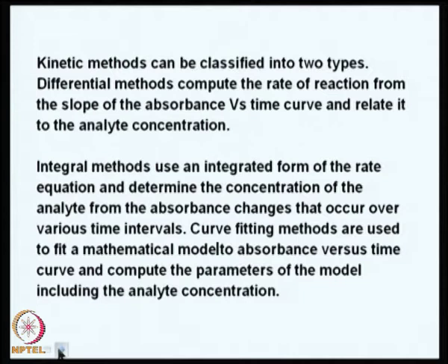For example, in the spectrophotometric follow up of reactions, in such methods the reactions with half lives greater than 10 seconds are amenable for spectrophotometric follow up. Otherwise, if less than that, it is not easy to follow the reactions.